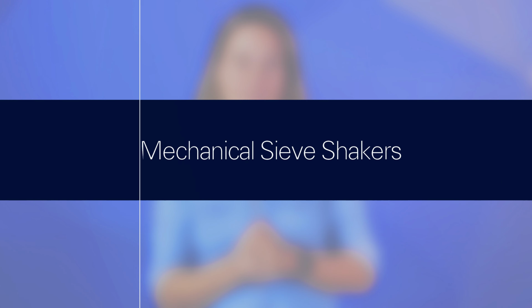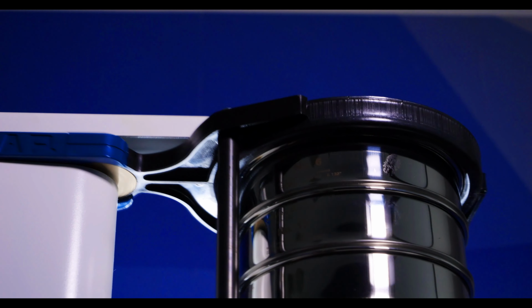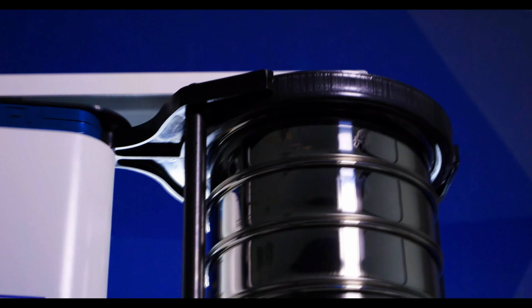There's a lot of different sieve shakers out there, but they can all be divided into two main categories: mechanical and electromagnetic. These are the most commonly used and popular types of sieve shakers. They simply use a hammer and circular oscillations to help separate the particles.